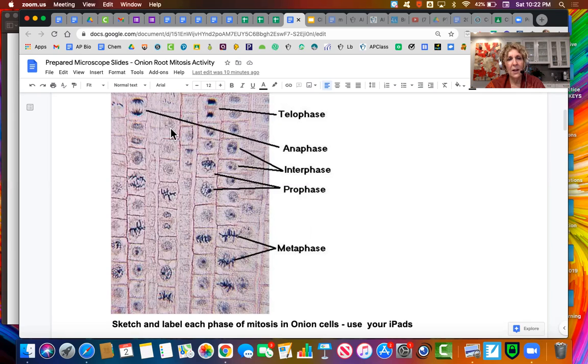And so here, this cell right here, you can see that is actually a little bit later. That's actually cytokinesis happening. Do you see that? This is a little later telophase, and I can see that the chromosome clumps have gone to each pole, and I can see the beginning of a new cell wall being laid down there. Okay, so those are pictures to remind you of plant cell mitosis, which is really easy compared to animal.